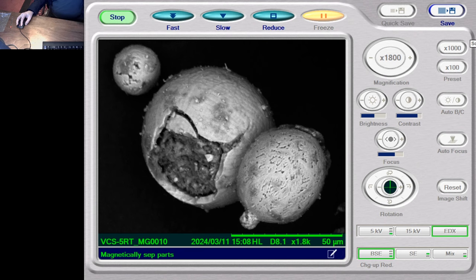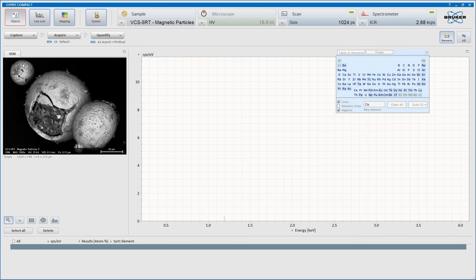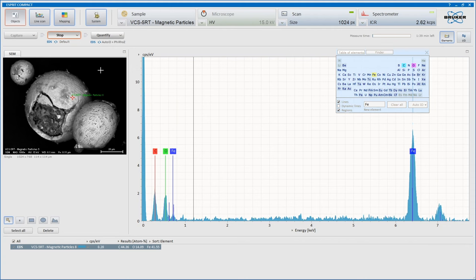So we will switch over here and we will clip here. What a beautiful thing. What a beautiful thing. So we are going to have a look at the surface of this one here, and maybe where, let's say there. And we'll have a look at that on its own right now. I suspect this is mostly iron, oxygen, carbon. I rest my case. Look at the amount of iron in there.